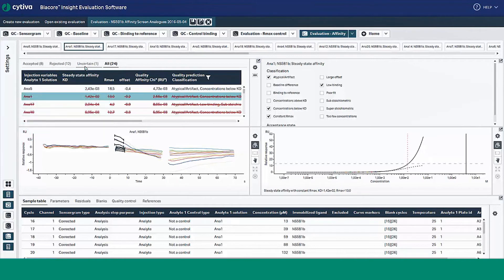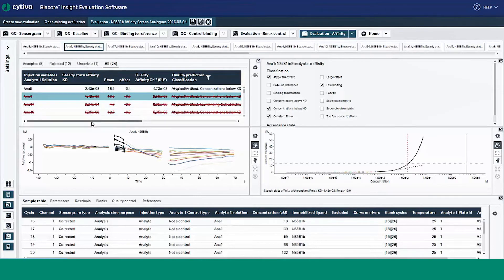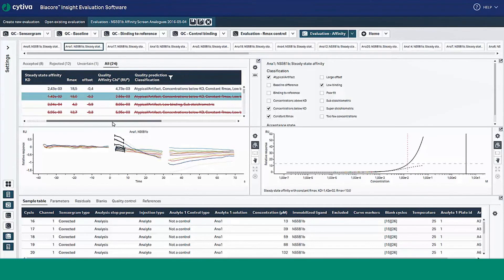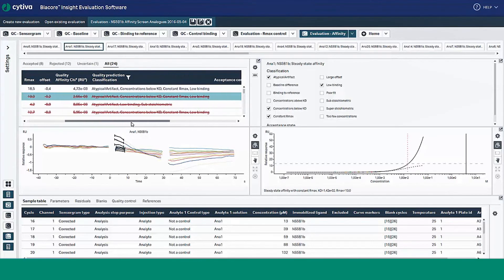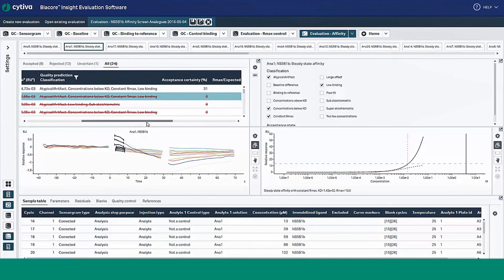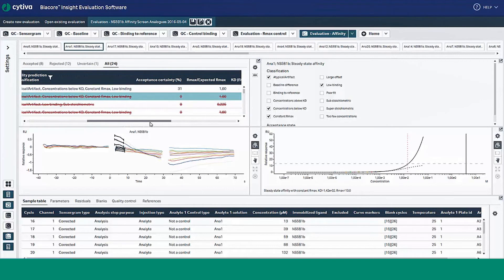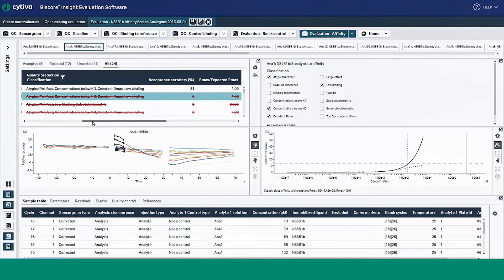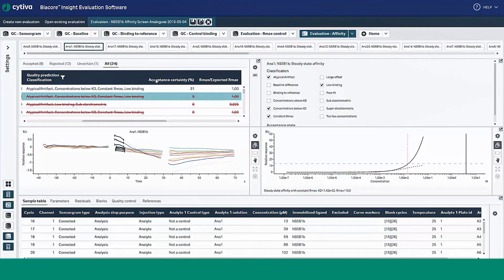Assignments are based on a series of feature sets including quality prediction classification of the data set, a percentage measure of how confident the model is in the prediction, baseline differences which can indicate residual binding on the surface from one cycle to the next, and the ratio of RMAX to the expected RMAX.